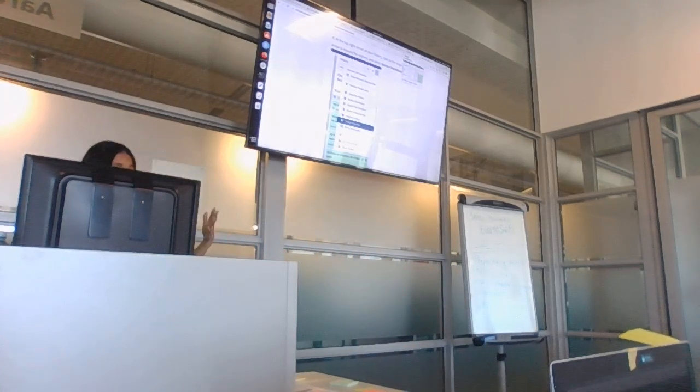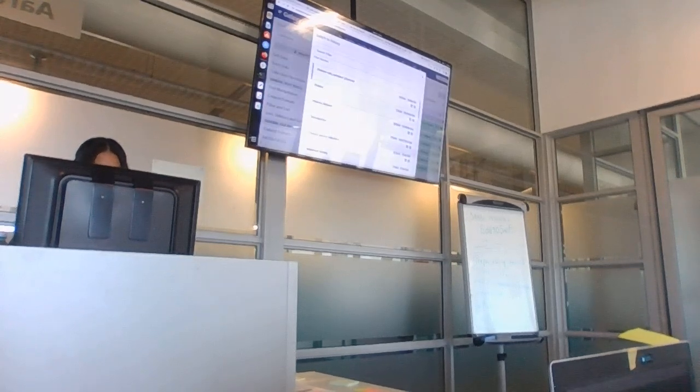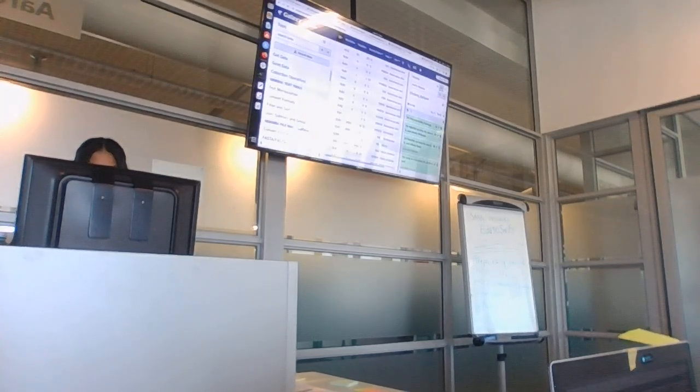Now in our case, we have that missing, but that's part of what we can do. So let's go to our cholera dataset, if you're not already on it. I'm going to delete this file because it was only used for the purpose of showing something. So this last file that you uploaded doesn't really belong there.